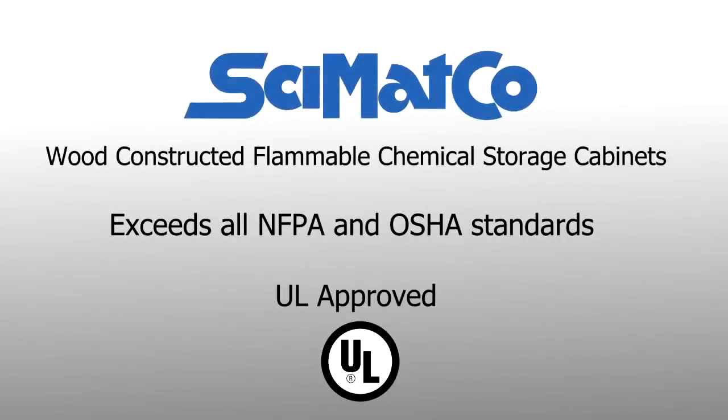Choose the proven protection of UL approved SciMatCo flammable chemical storage cabinets.